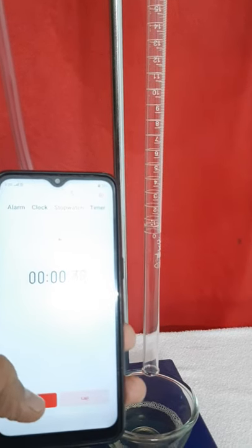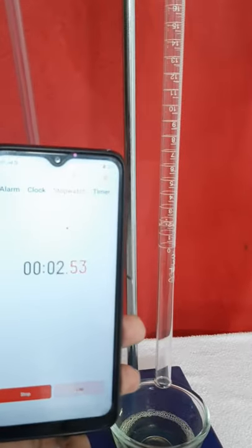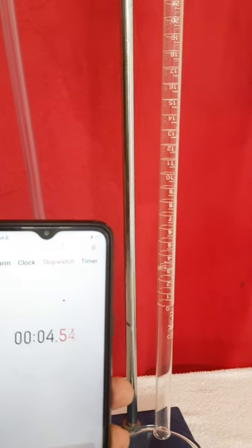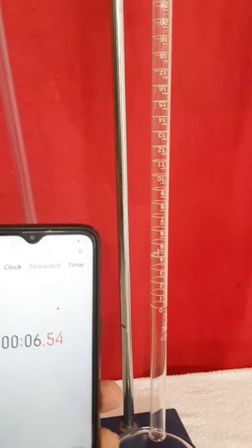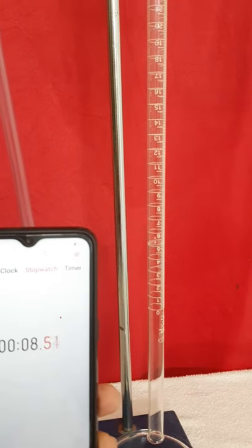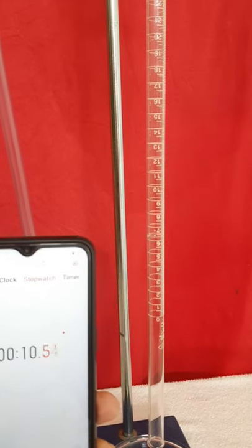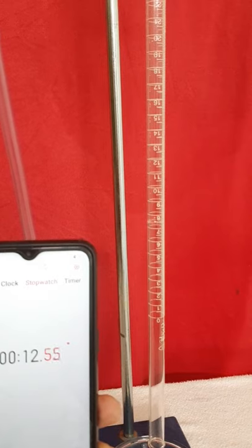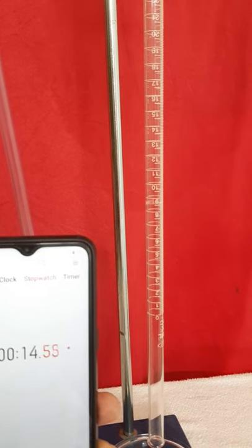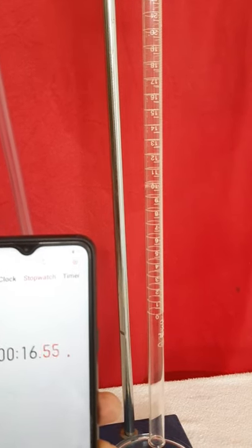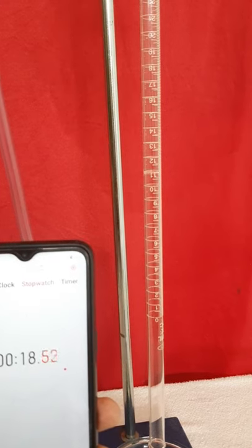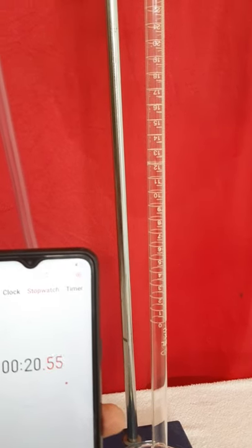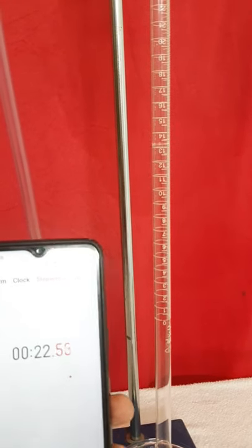My stopwatch is started. Now I'll watch till it reaches 20 ml. That soap bubble is now at 9 ml, 10 ml, going up, 13 ml.